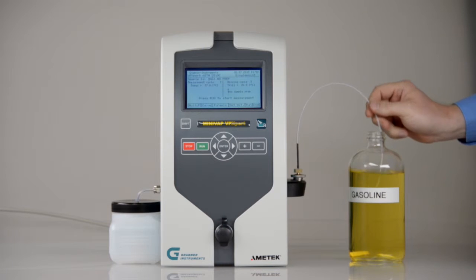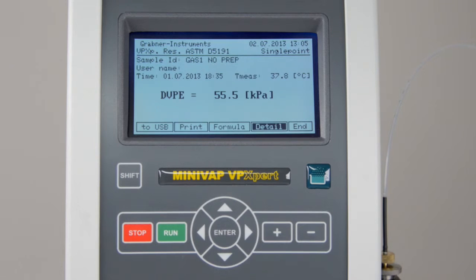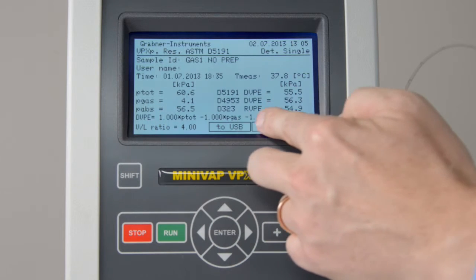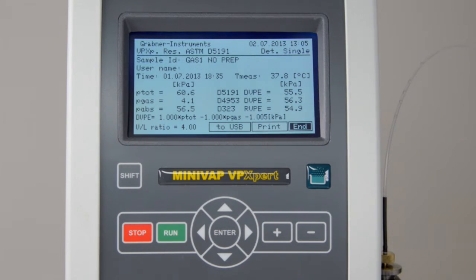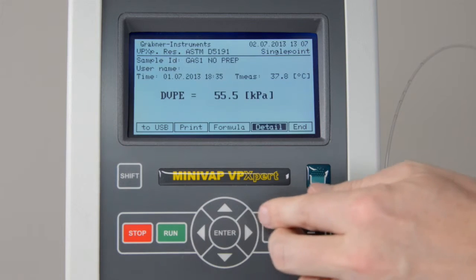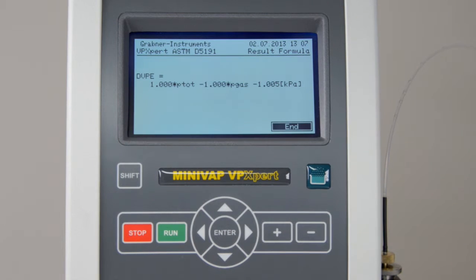Put the tube into the sample, then run the program. The DVPE result will show directly after the test. Select the Detail button and press Enter to view all measured data and correlated values for other measurement standards. Check the formula: DVPE equals 1 times PTOT minus 1 times PGAS minus 1.005 kPa. This is the DVPE correction for measurements without sample preparation.